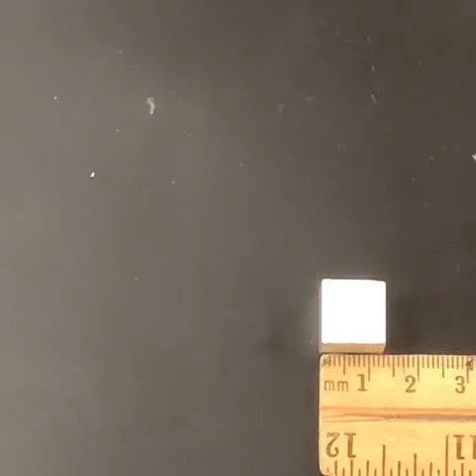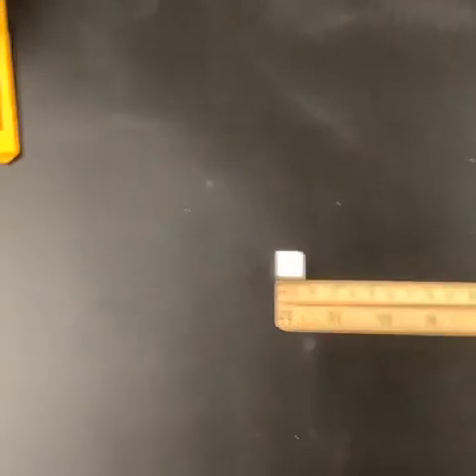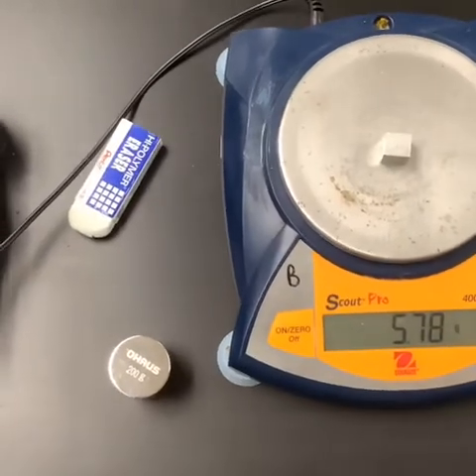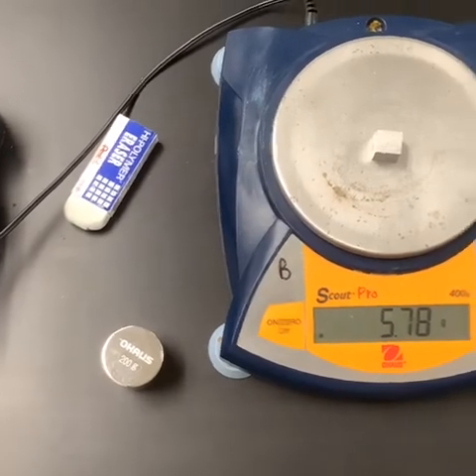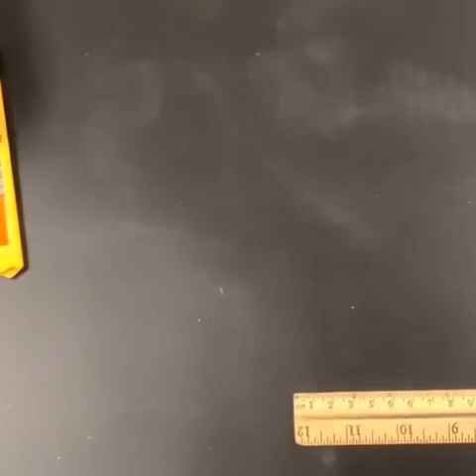Let's go ahead and take a look at what our mass would be. So we're going to go ahead and get a digital scale out here. Let's go ahead and zoom back out again. And so for the digital scale, we're going to go ahead and come over. We're going to take our aluminum cube and place it on the digital scale. So we've got 5.78. All right, 5.78. And that's going to take care of our first piece.